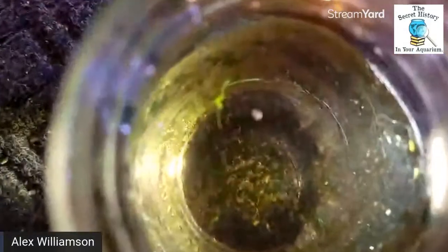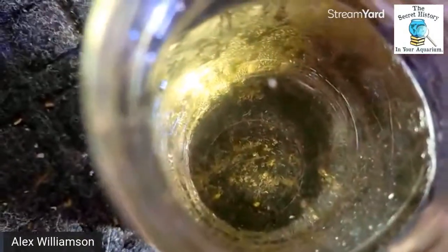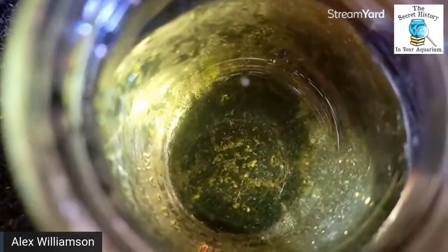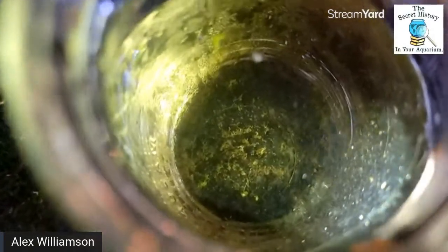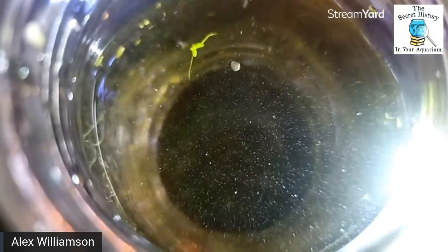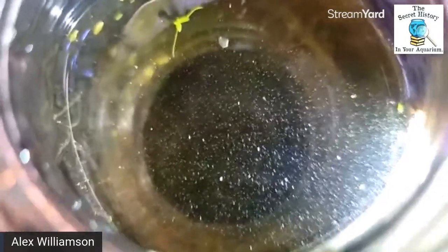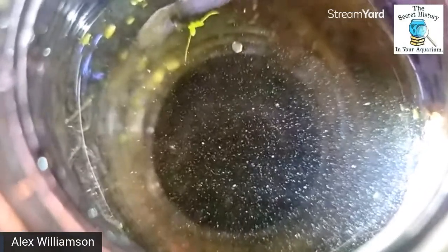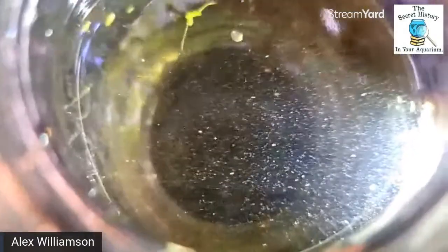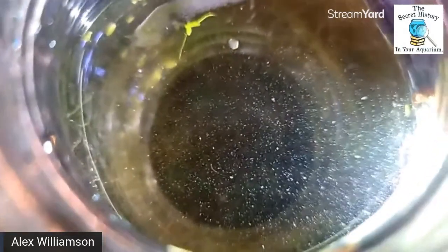we picked up the mulmier stuff that was in here, the mulmiest mulm in that corner, the substrate from outside. And we didn't see much of anything other than clots of dirt and some really teeny life forms. But in this clear water, aka not clear water, when you get a really strong LED up to it, look at that. That's what we were seeing, was these life forms. Now, those life forms you can see moving around, we didn't see any of those because they would have been the entire screen, even at the lowest setting.